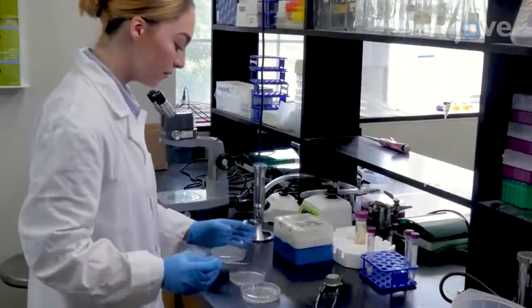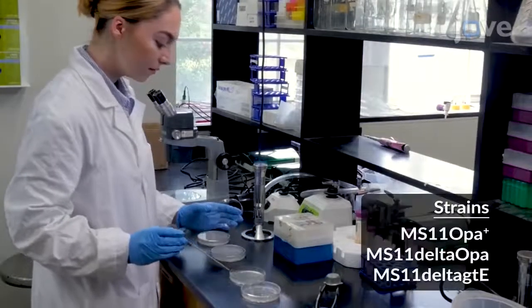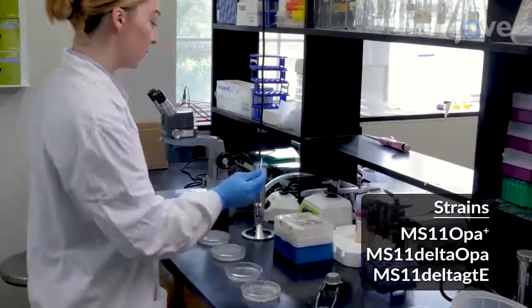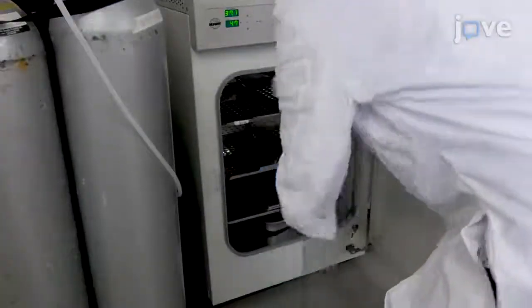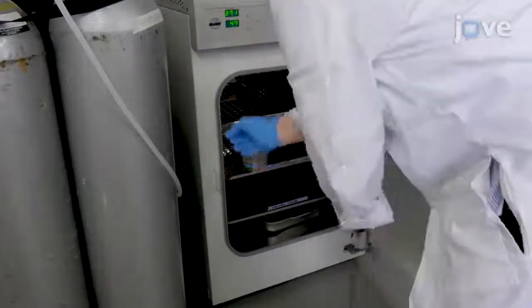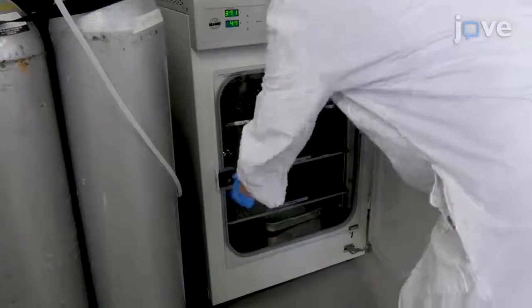Begin by streaking Neisseria gonorrhoeae, or GC strains, on GCK agar supplemented with 1% Kellogg, for a 16-18 hour incubation at 37 degrees Celsius and 5% carbon dioxide.